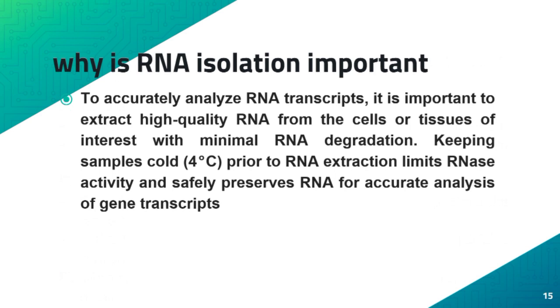Why is RNA isolation so important? To accurately analyze RNA transcription, it is important to extract high-quality RNA from the cell or tissue of interest with minimum RNA degradation. Keeping the samples cooled at 4 degrees Celsius prior to RNA extraction will limit RNase activity and safely preserve RNA for accurate analysis of gene transcription.